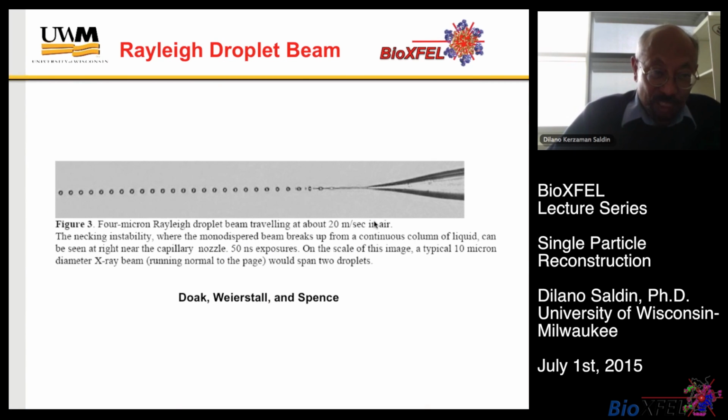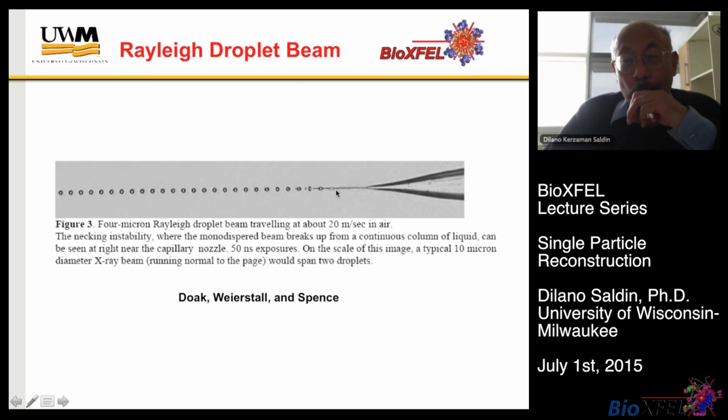That's of course an oversimplified picture. In reality, one uses some kind of injector, and this is an early injector that was used by John Spence and group. And what this injects is a set of droplets, each containing the proteins that we are interested in.